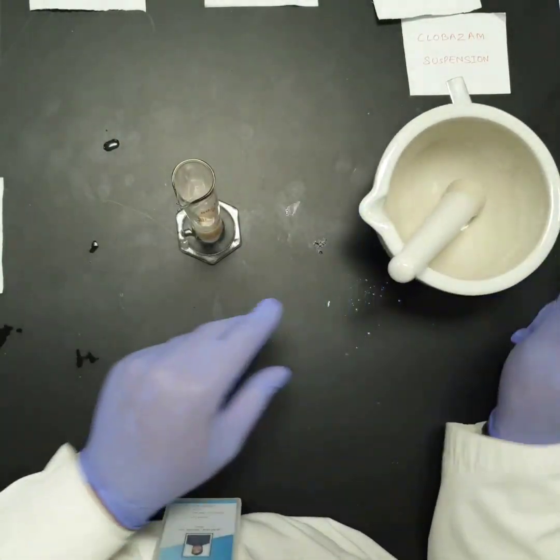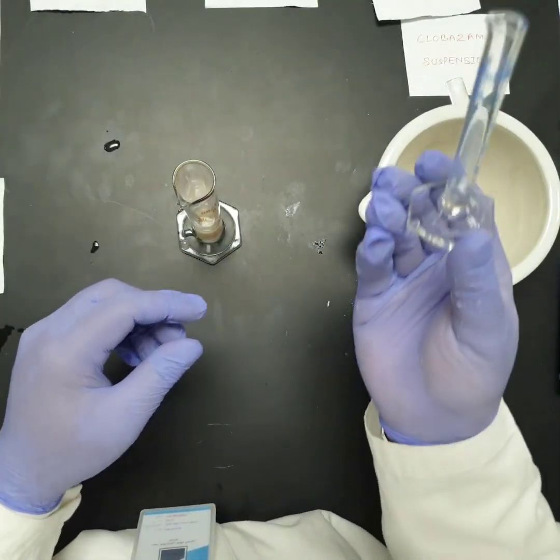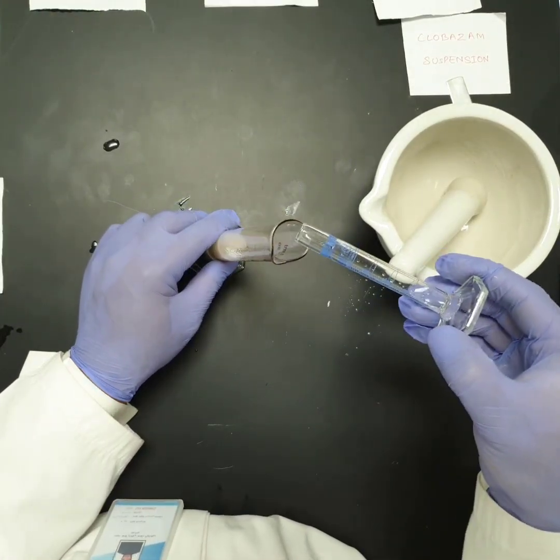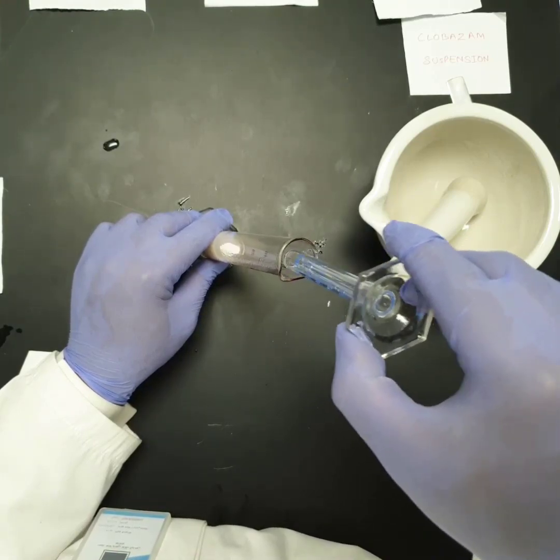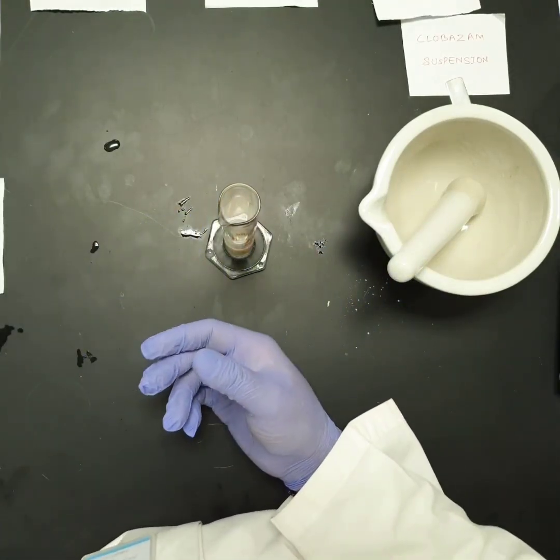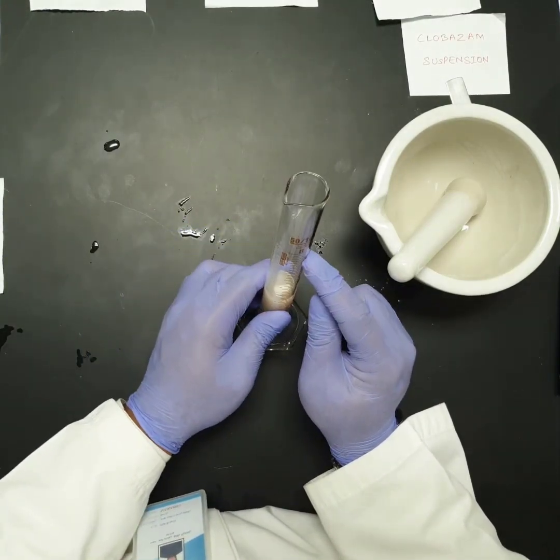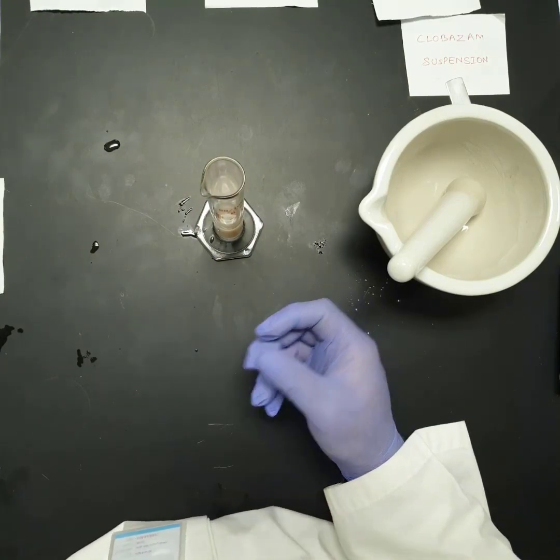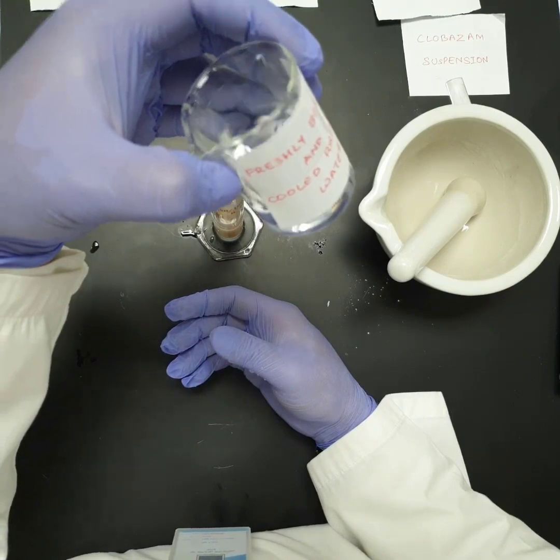Now it's time for me to add the peppermint water, which is 1 ml. Okay, now I'm going to add peppermint water into the graduated cylinder. Now I have to adjust the final volume to 50 ml with freshly boiled and cooled purified water. This is freshly boiled and cooled purified water.